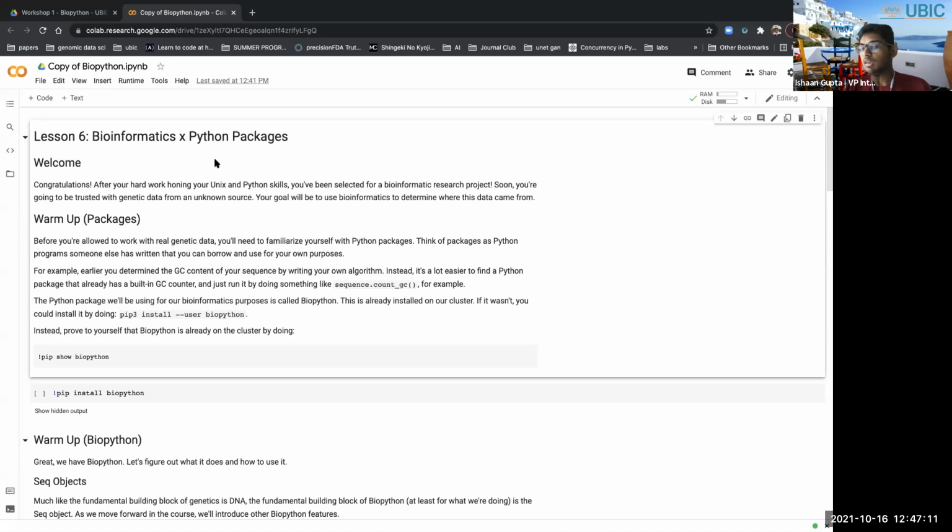Now for these things, you can use the Python standard library, but there are more efficient ways, and you don't have to code ways to get the reverse complement or transcription, translation, all of that stuff. And also for making alignments, you're not going to build an alignment pipeline using BLAST, an online tool, or using AliView or some other software. You want to do all those alignments in the same script. What do you do then?